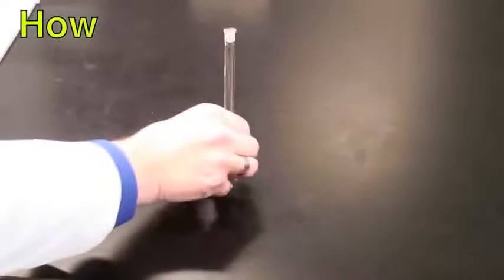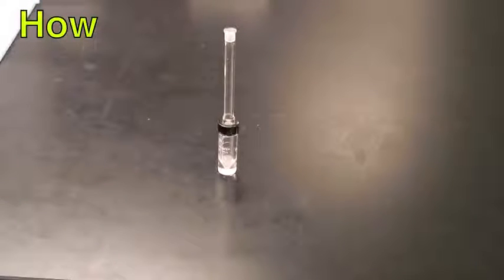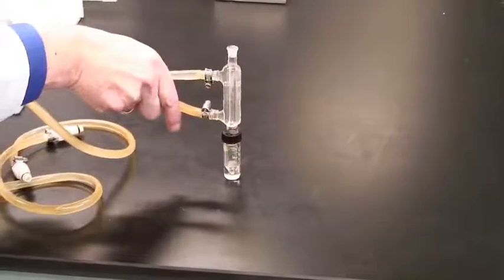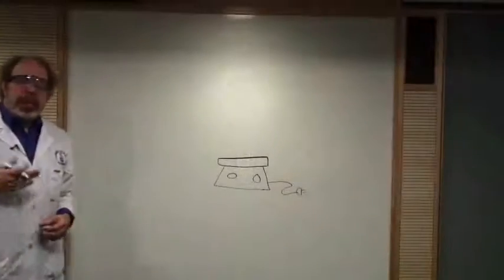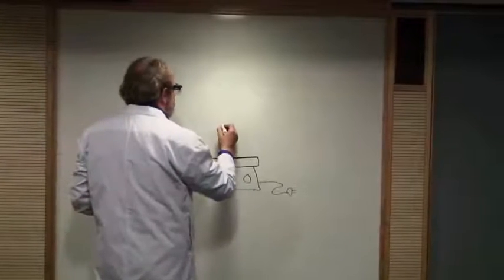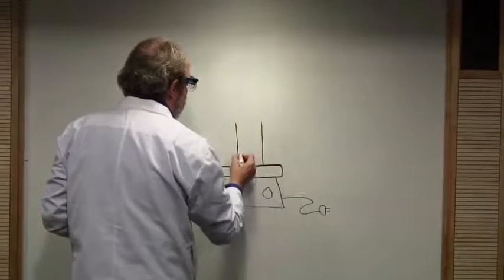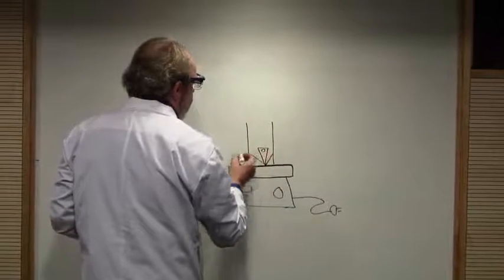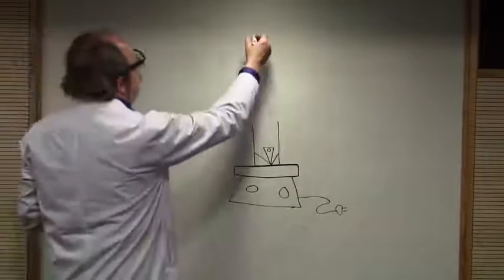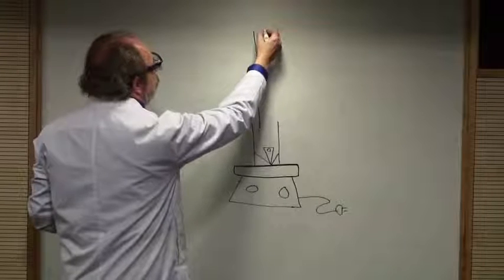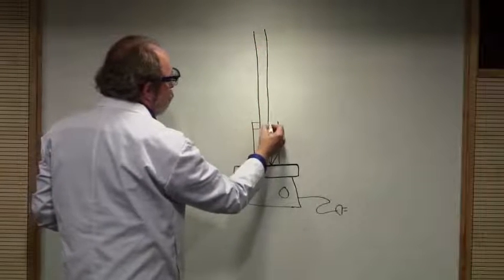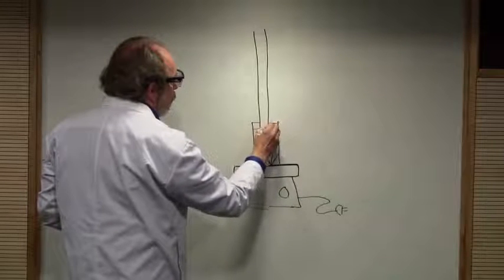Here is a reaction vessel with an air condenser attached, and here is a vessel with a water condenser attached. It's a little more tippy so we'll have to clamp that. You'll be heating using a hot plate and a conical-bottomed reaction vial, and you'll always put a spin vane inside. There will be a condenser — shown here as an air condenser, though the same principles apply to a water condenser — held in place by the cap.